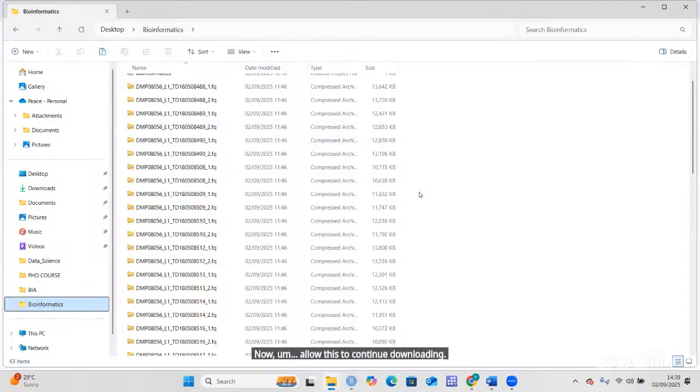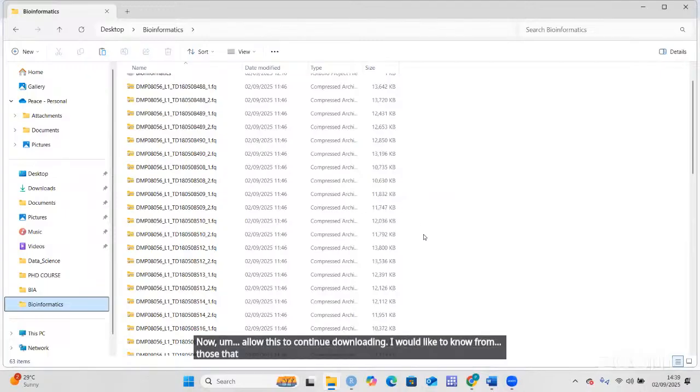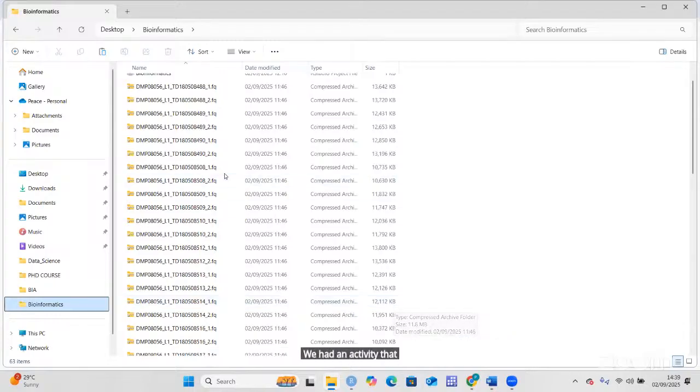I would like to know from those that attended the webinar yesterday, we had an activity that we were supposed to do. And in that activity, we were supposed to run the metagenomics packages file. In the comment section, did you manage to run them?